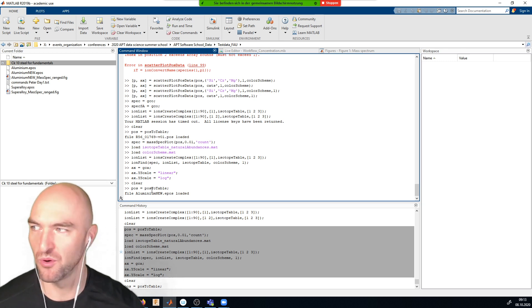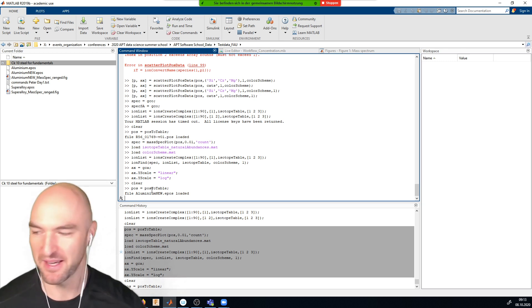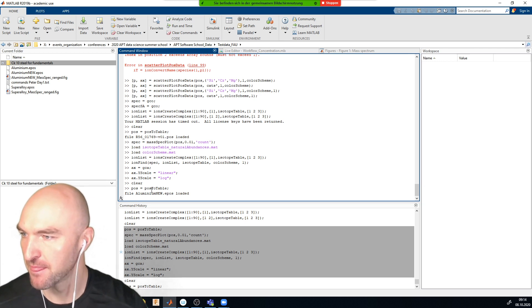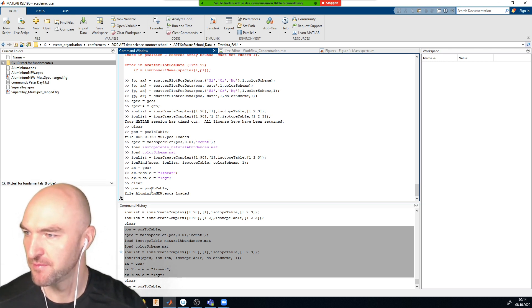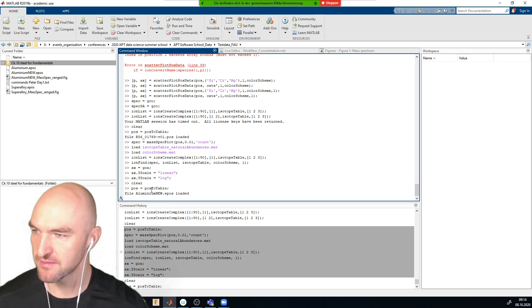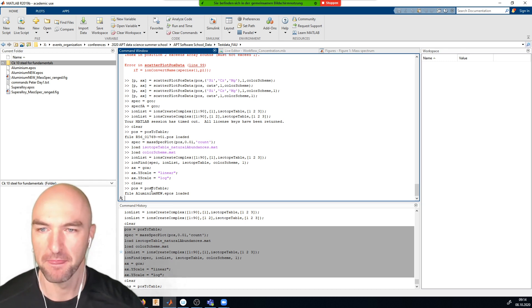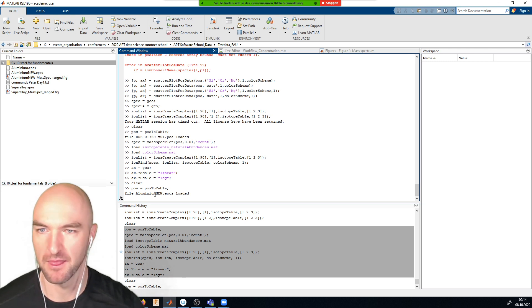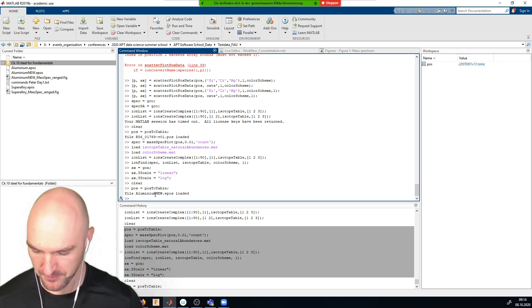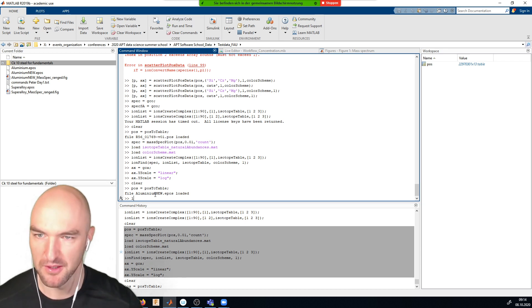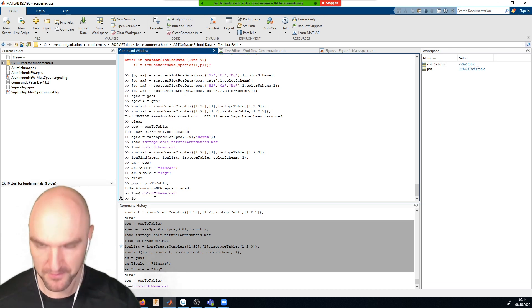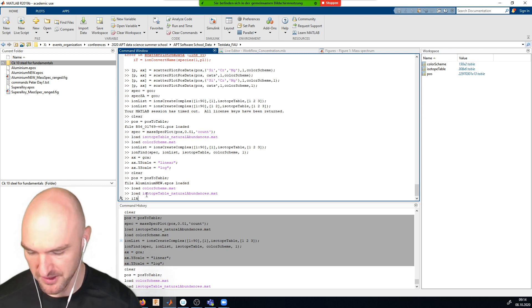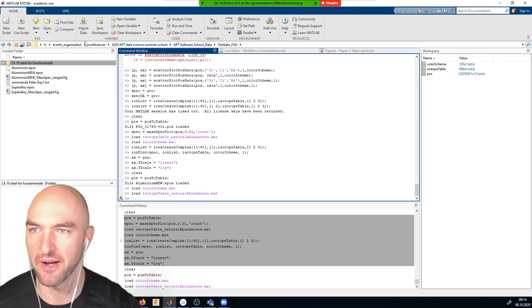Sorry we didn't give you all the accompanying information with the aluminium dataset — it's from a commercial project. I'll reload the color scheme and isotope table. We don't need the iron list for now.